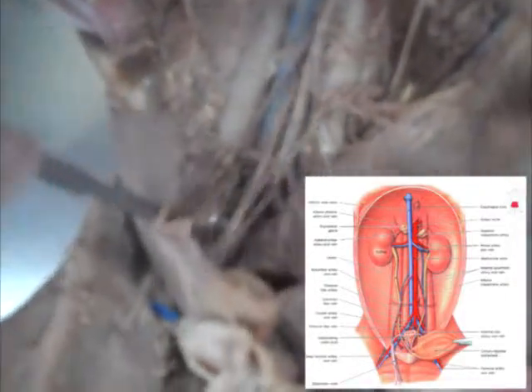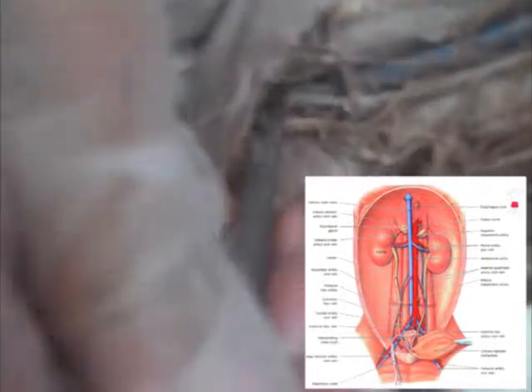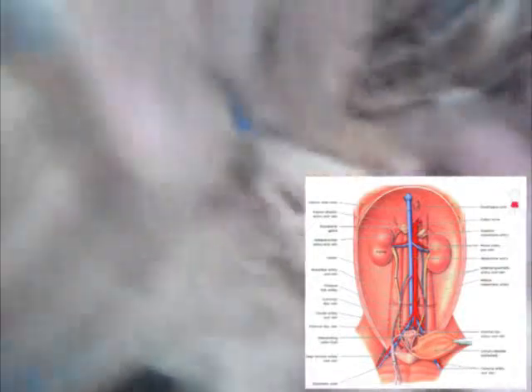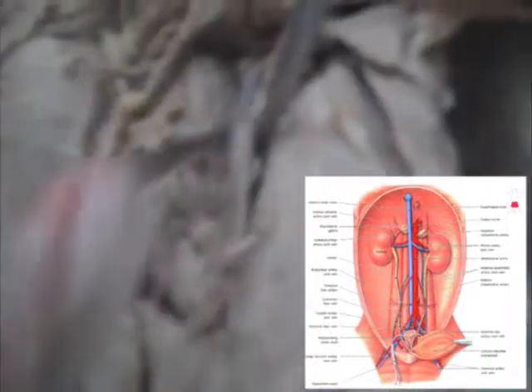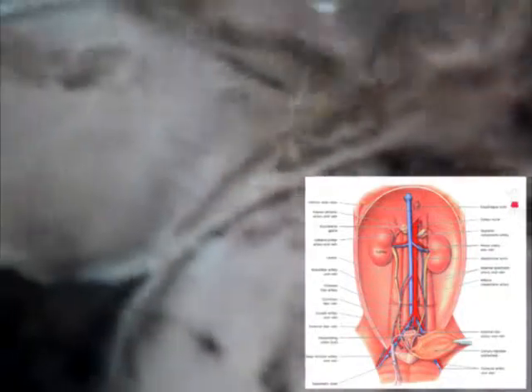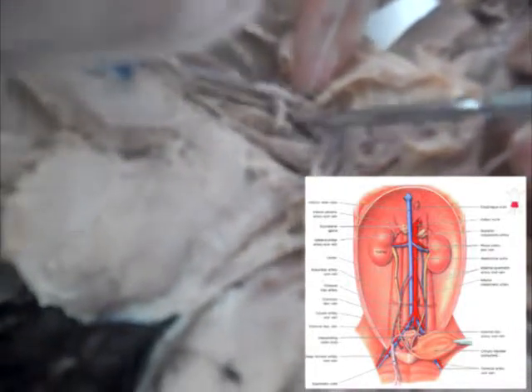And those split up even further, if you can get a really good view right here. External arteries. And then these caudal arteries and veins right here split up into even more parts called the external iliac veins. And then these travel down the leg. And as you see here, we have an example of a deep femoral artery right here. Look at that nice red color. And then over here we have the blue deep femoral vein.